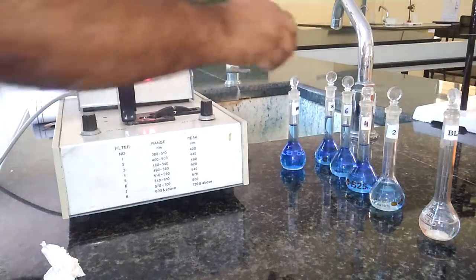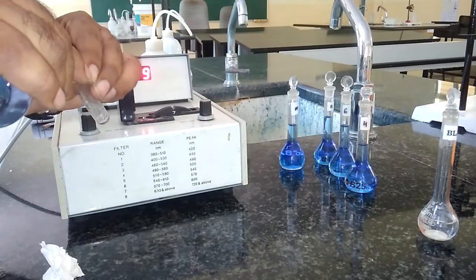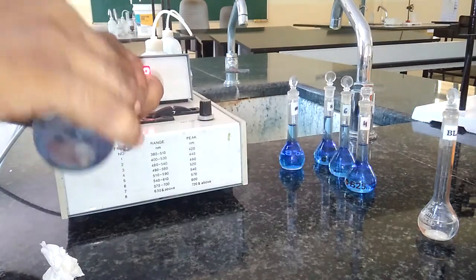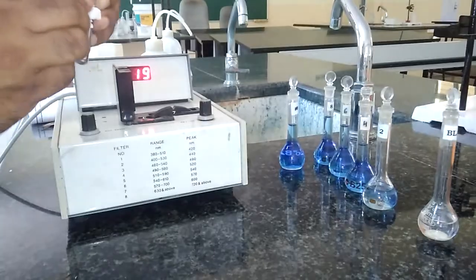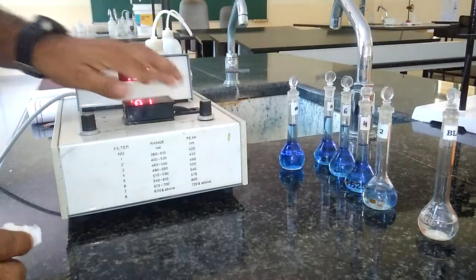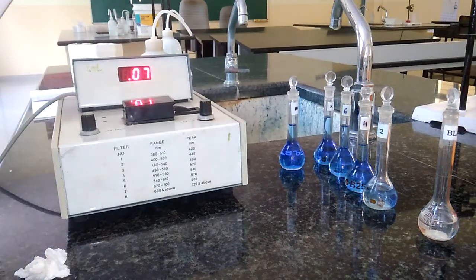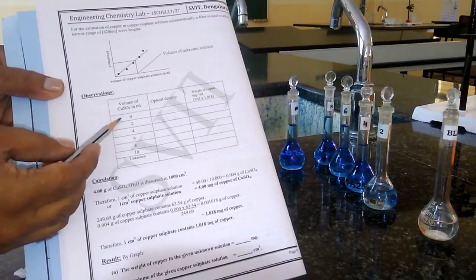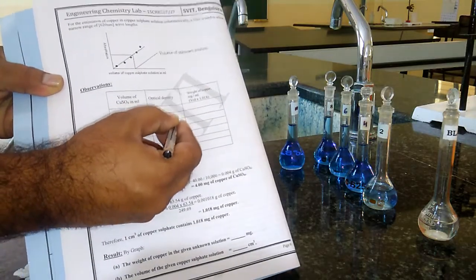We have to measure the absorbance at the same wavelength for all the rest of the colored solutions, starting from 2 ml. Before adding, we have to rinse the cuvette with the same 2 ml copper sulfate solution. Then fill to three-fourths, wipe well to remove moisture content, and record. It is giving 0.07. So 0.07 is the absorbance for the 2 ml copper sulfate solution. For the blank (0 ml), we record nothing. For the 2 ml, it is 0.07 absorbance.